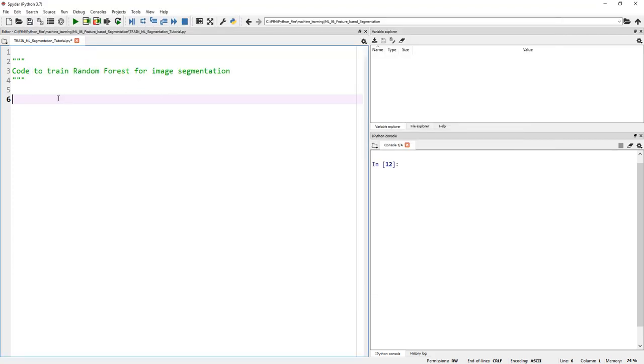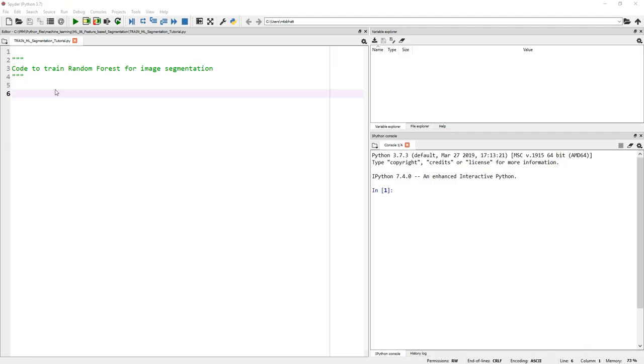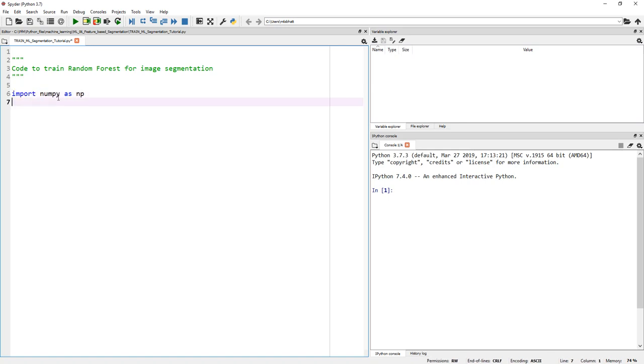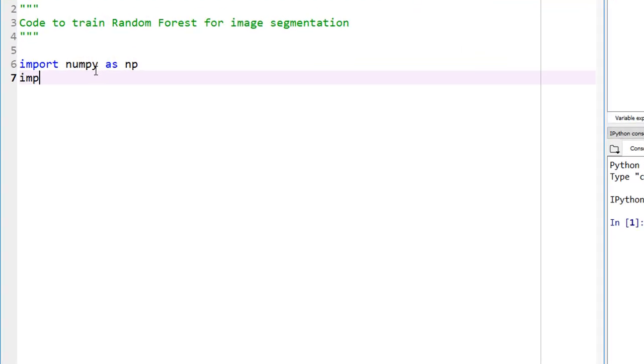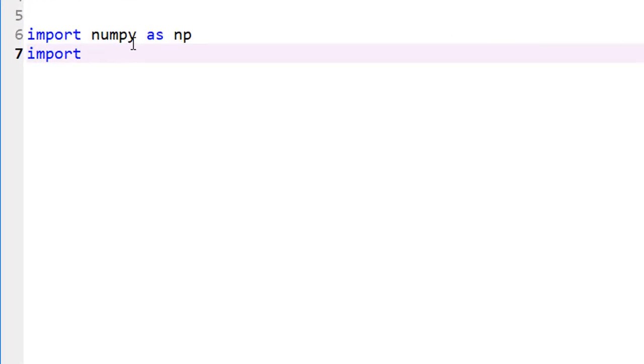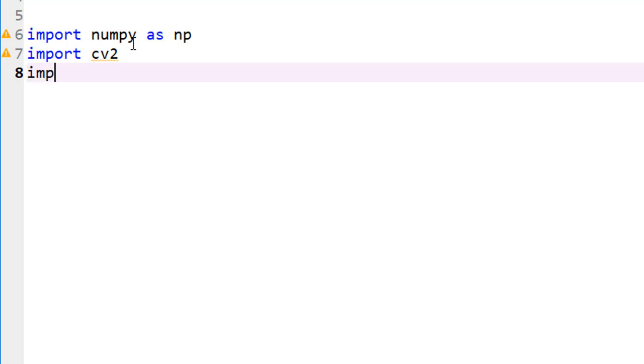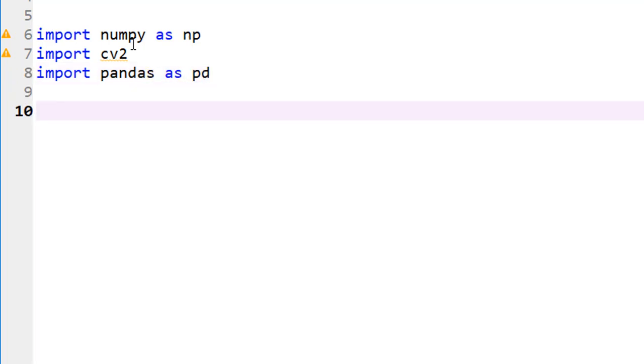Obviously, step number one: importing the right libraries. As usual, let's import the standard libraries. Import numpy as np, then import OpenCV so we can read images and apply image processing functions. Import pandas as pd to handle our data as data frames.